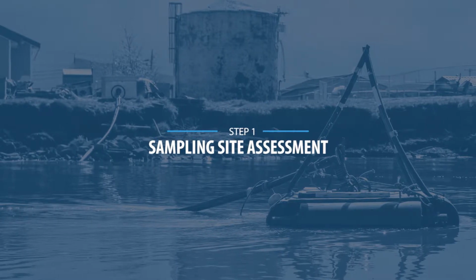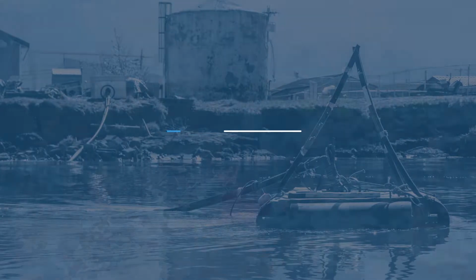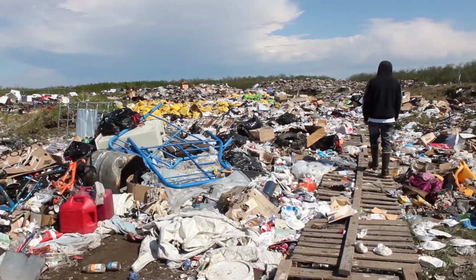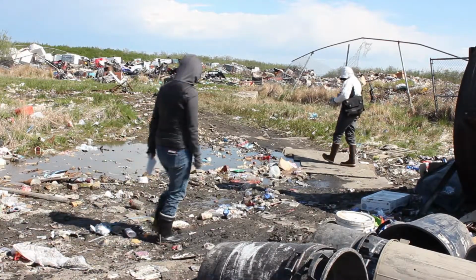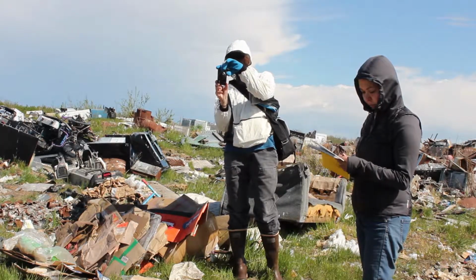Step 1. Sampling site assessment. The first step is to do an assessment of the landfill. During the assessment, you will walk around the landfill and look for potential problem areas to document and determine your sampling sites.